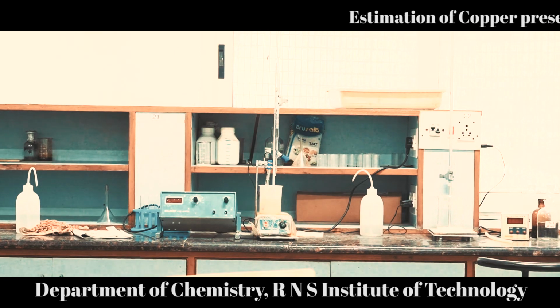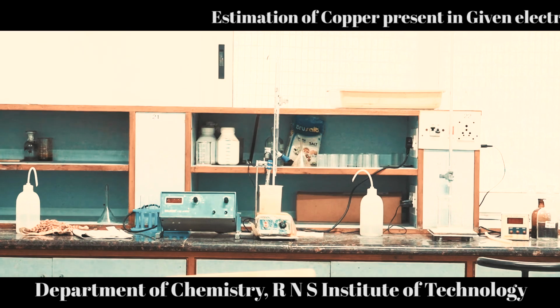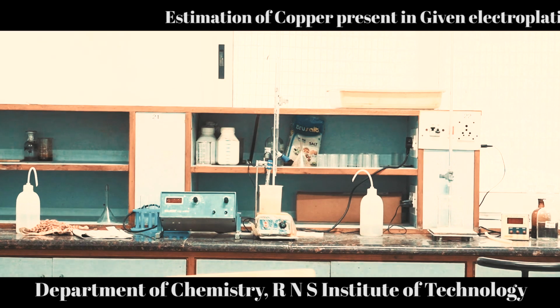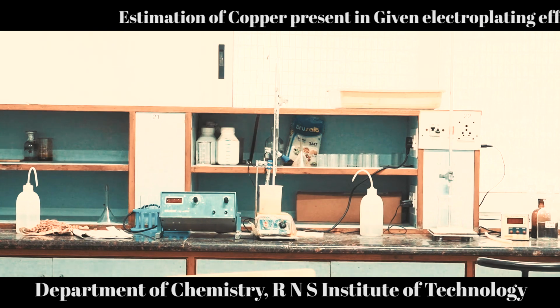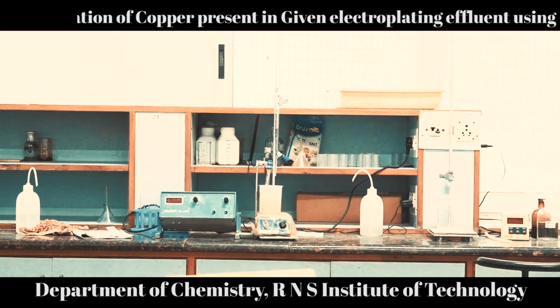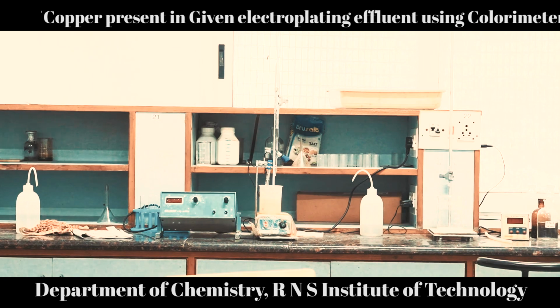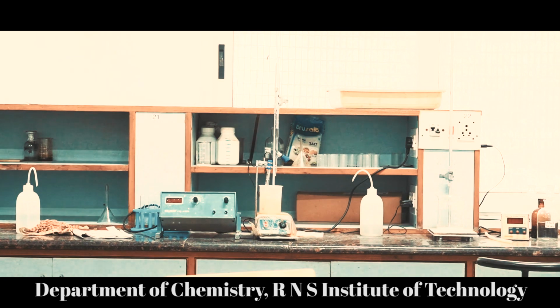Absorbance of our test solution is 0.23. From there, we are taking up a perpendicular line which cuts the linear line. And from there, we are joining the line to the x-axis. The point where it joins the x-axis gives the volume of electroplating effluent present in the given test solution, which is 3.8 ml.